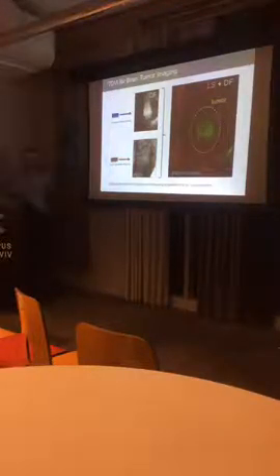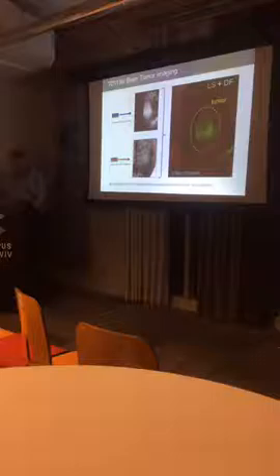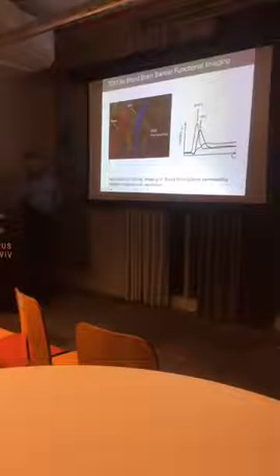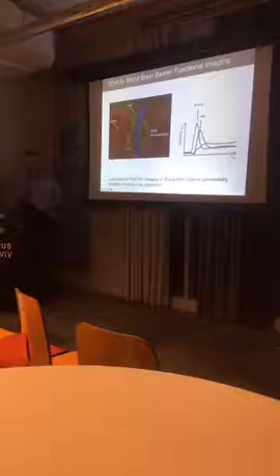There are many, but it's more technical information, more biological. The speckles are a little bit easier to use. They have some limitations. So actually we use the speckles for navigation and fluorescence in order to make a final snapshot. So it's not an interaction, it's an additive combination. It's additive image processing, not physical. And we do it simultaneously because of the filter cube. And we can do speckles simultaneously with the same camera? Yes, absolutely.